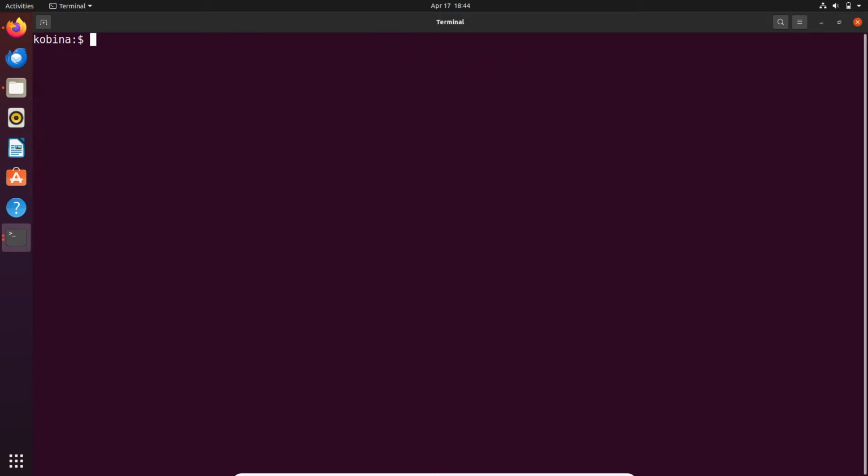Let's clear the screen. Let's ls into all reads again, and then let's do it. So now we are going to do the merging in a refined way. Before I even proceed, let me say that it's always important to have a good naming convention so that you're able to process files such as this. We know that for all the files, we have a sample name separated by underscore, the lane information separated by underscore, and R1, which is the read type. So assuming that all your files have this naming convention, it becomes easy to reproduce what I'm doing now.